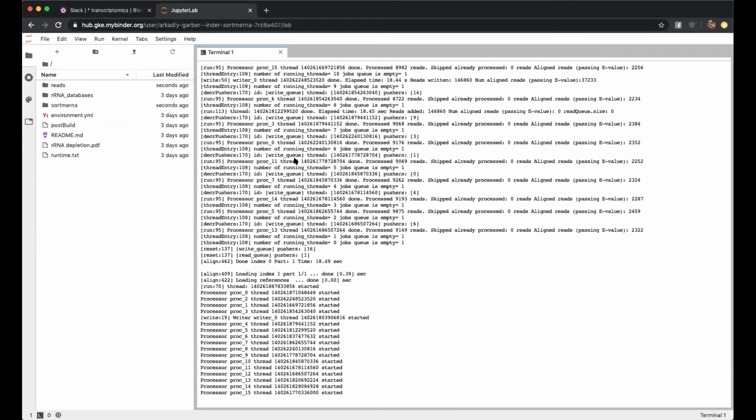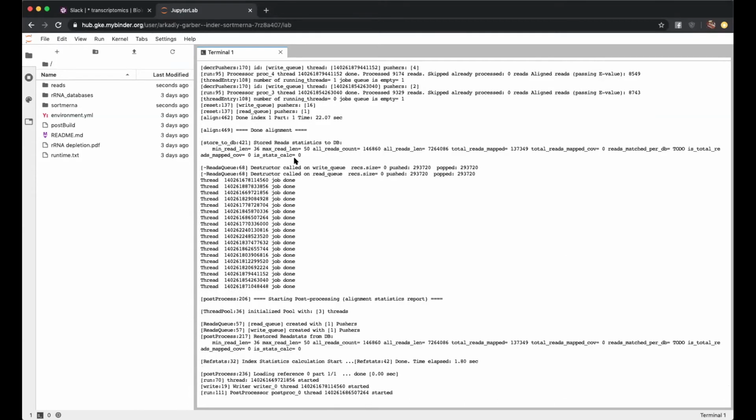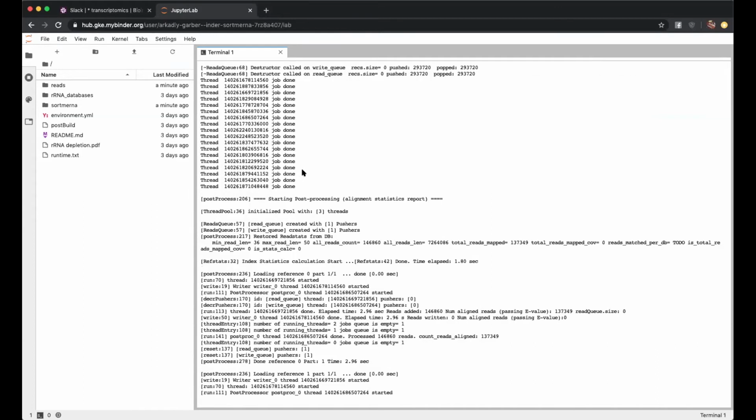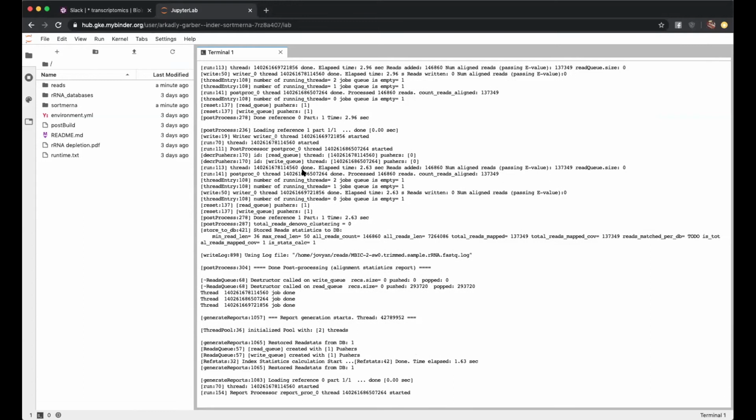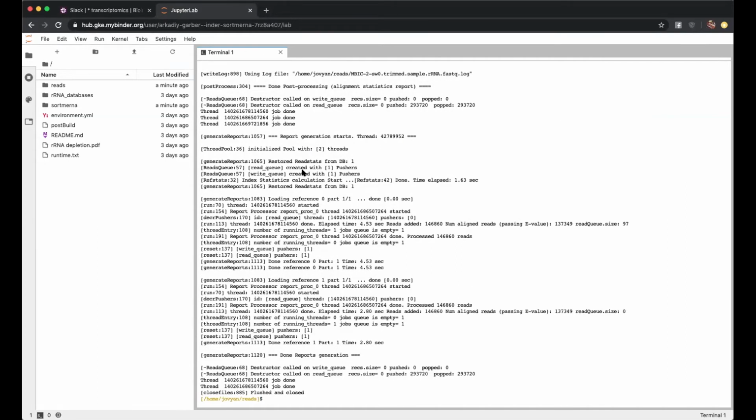Okay, that's good to know. What happens if you do -t 16? I think it's just going to use 1 still. Can you repeat the question? If you try to run something with --threads 16, is that going to break anything, or is it just going to use the 1 that's provided? I don't know, but when I was recording another tutorial that uses all the threads available, it was just using the 1. That's how I figured it out. Good to know. All right, thanks, Ella.